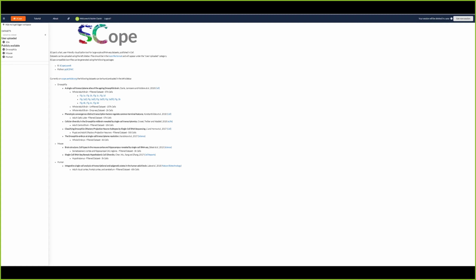You can just click on a data set to bring it up. It'll highlight to show that it's being brought up, and you'll get displayed with the plot. By default, we show the UMAP in many cases, but on the bottom left below the data sets, you've got a nice little settings bar which lets you switch between the different dimensionality reductions. Here, I'm going to switch it from the UMAP to the t-SNE, and you'll be able to see a very familiar plot that we've seen already in a bunch of these slides. And there's some other settings here that you're able to leverage and play around with to change how you're looking at the data.